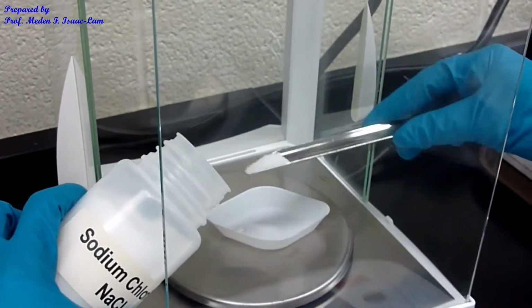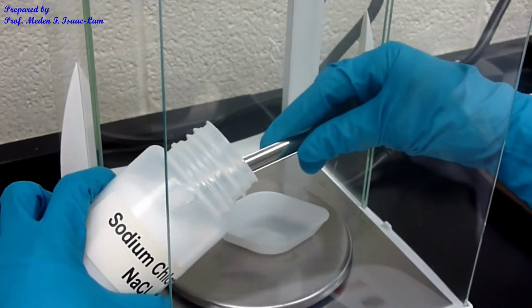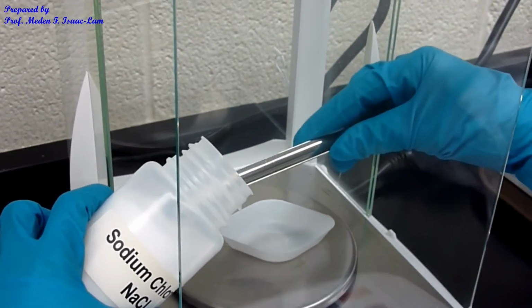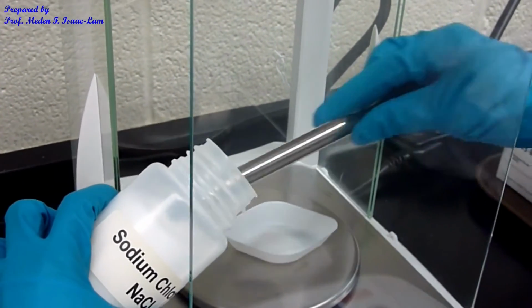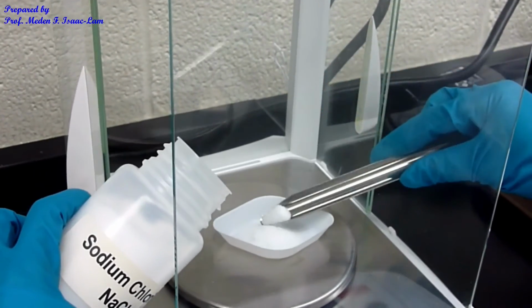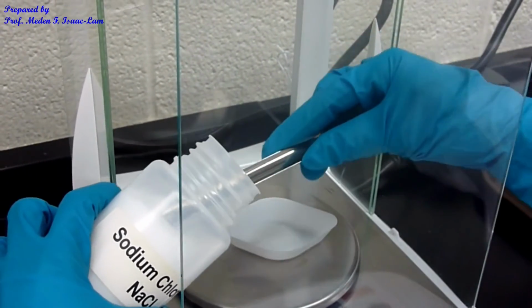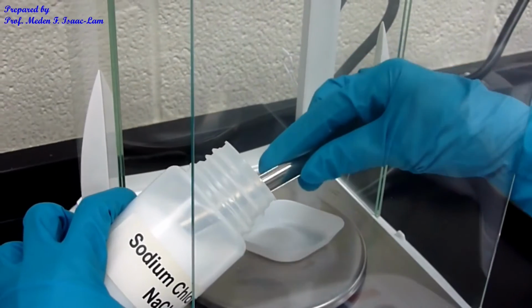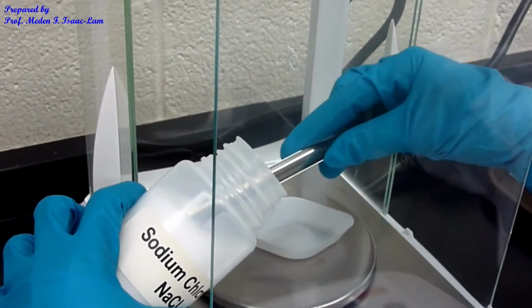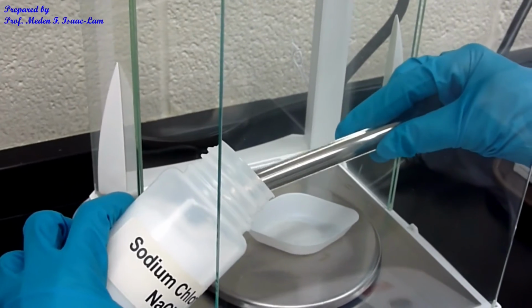I need more, 5.844 grams. A little bit more.